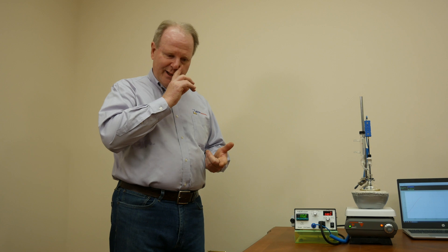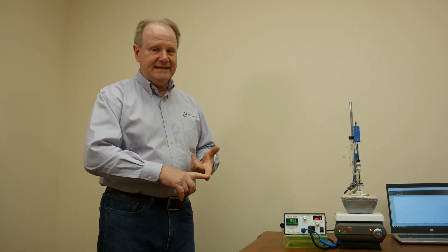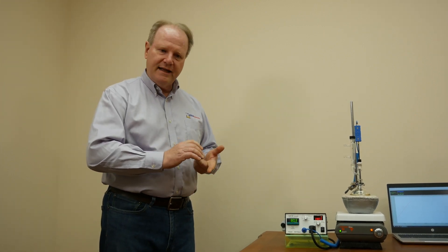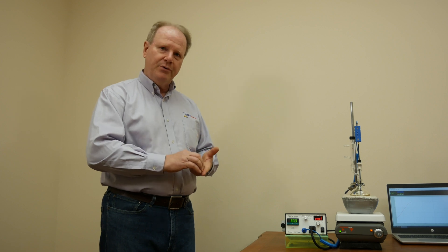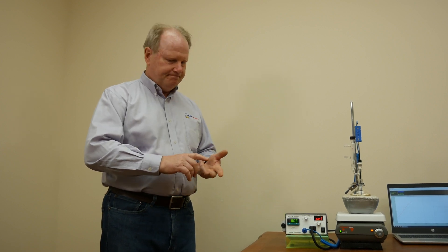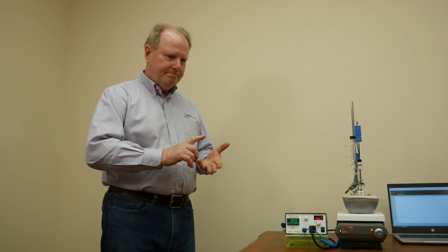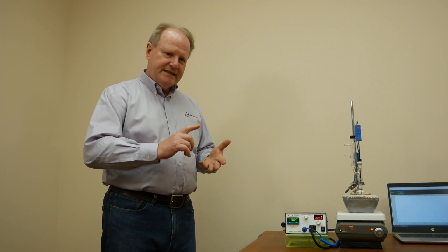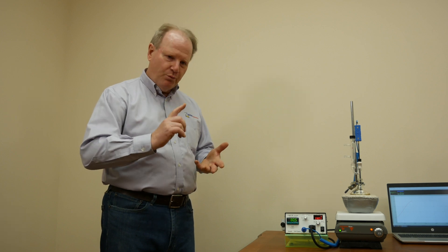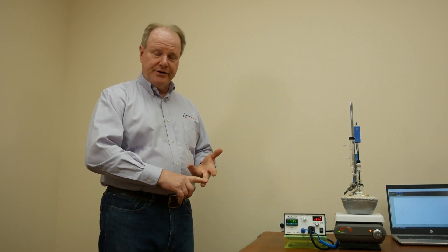In reality the best feature of JCAM's temperature controllers is they're accurate. If you ask for 80 degrees you get 80 degrees. You don't get 79.4, you don't get 80.2, you get 80.0 degrees. With any heater, any volume, JCAM's controllers, plug in your controller, enter the set point you want and walk away because you're done.